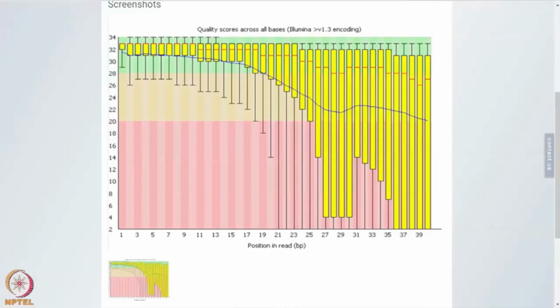So you want to make sure that whatever variations you are calling, on the basis of which you may be taking clinical decisions, are accurate. You have to be 100% sure that the base you are calling as a variant is actually a variant. This is where something like this becomes extremely critical.